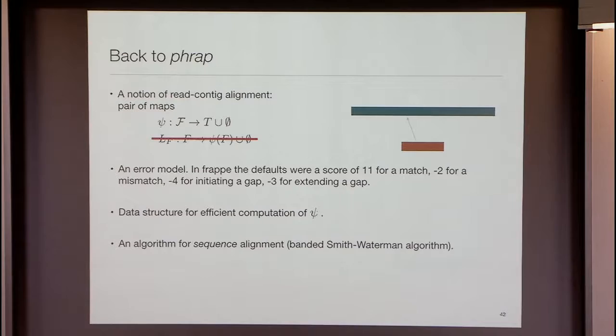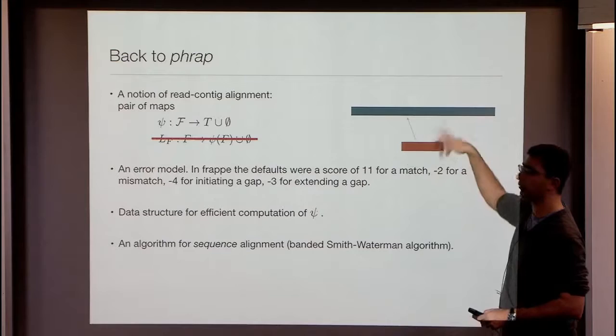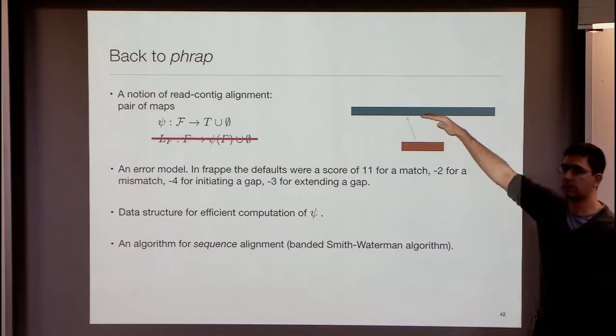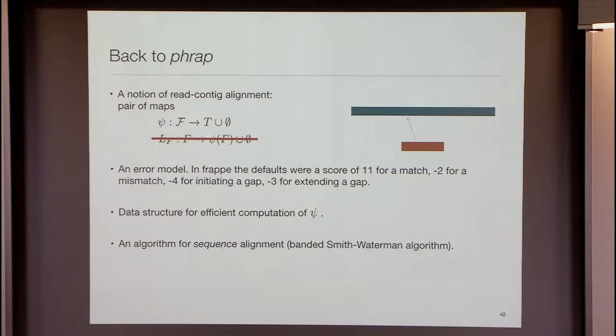Nick asks us something sort of different, because that is asking for a lot. Sure, you can pseudo-align by asking for every base here to be exactly contained in one of your targets, and figure out which target. Nick said, let's relax that assumption and just ask, can we tell where this aligns, allowing for errors, but not worrying about the individual base pair alignment? And we actually searched a lot, and we couldn't find anybody that had done this, even though it's a very obvious question.